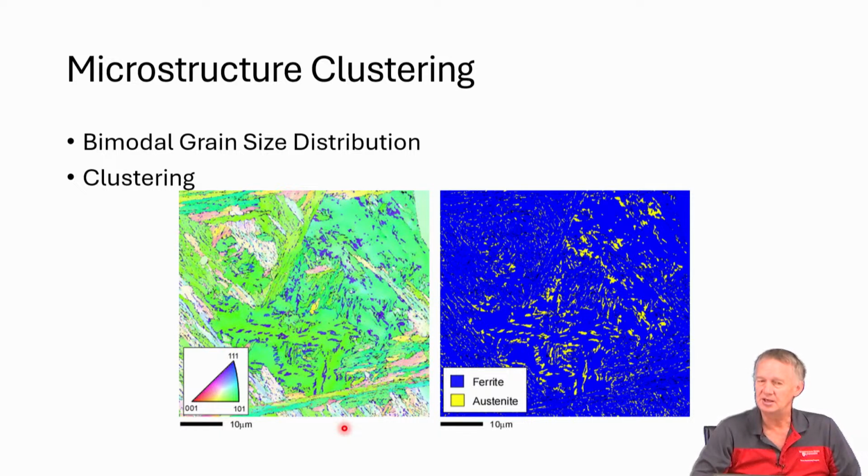And the other thing is with cubic crystal systems, I usually use 7, maybe 8 bands maximum when I'm doing EBSD indexing. If you're using a higher number of bands, 12 or something, then you have a higher probability of getting some incorrect bands mixed in, which will lower your confidence. So it depends a little on how the system's used, but in general, there shouldn't be a problem distinguishing between the two.